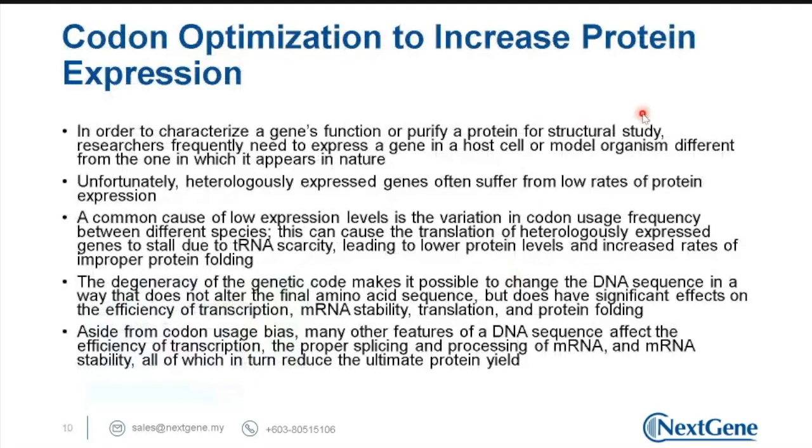Okay, here we shall take a look at what exactly is codon optimization and whether we should perform codon optimization or not. Okay, so before we make a decision whether we want to perform codon optimization, let's take a look at what it is and why we want to do it.